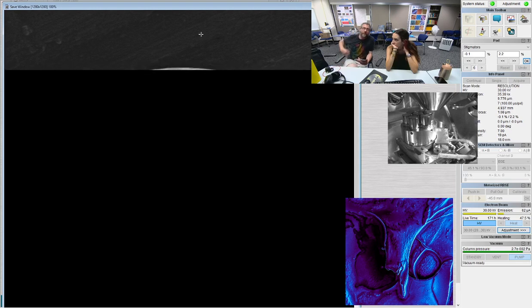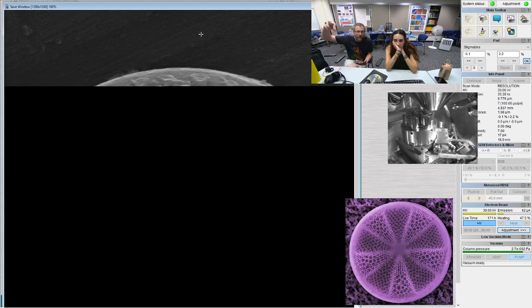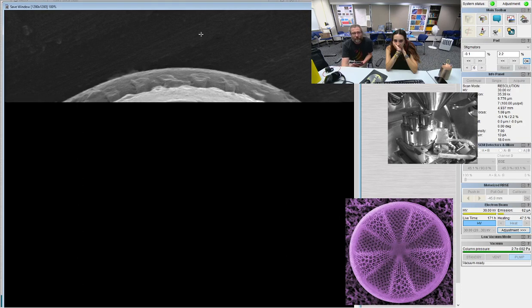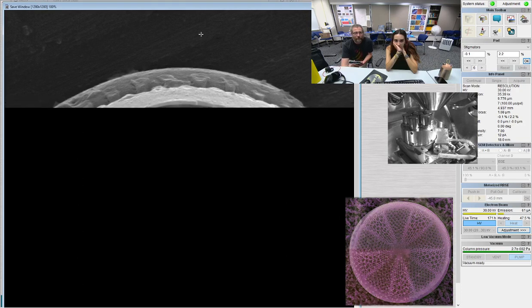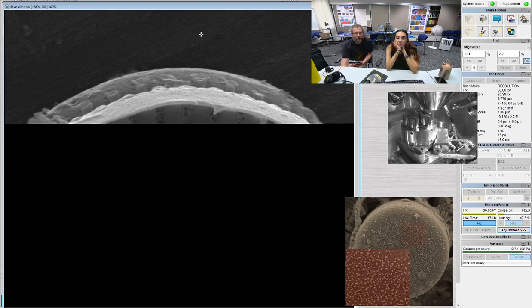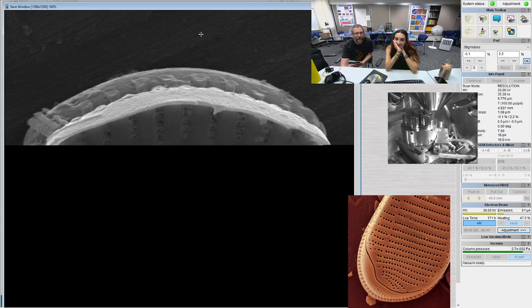We've seen some of those. Dr. Winter sometimes has samples in here with acantharia in them. They look like little stars, with radiating spines that point out from the center. They're pretty cool, and sometimes they show up on the Pacific plankton stream, so she sees some living versions of them in the marine realm. They're not in freshwater, only in the oceans. This one, the genus, I think it's like a Starocyra or something like that. It's two Starocyra sisters that are back to back, right? The valves are back to back.